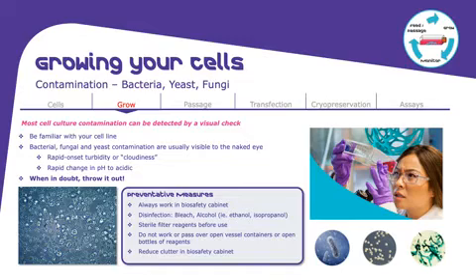Don't do it. Don't use it. To prevent any kind of contamination, as I mentioned, always work in a biosafety cabinet and clean and disinfect all your equipment which you work in. Use sterile filtration for the media and the reagents. Make sure that everything is clean around you.